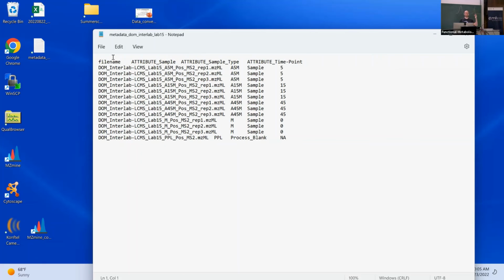So when I was on a research cruise and we were getting samples from CTD casts, and there were 20 other research groups working on those same water samples and sharing all their data, I maybe had 100 columns here for all this metadata. And this is all information about the sample, right?